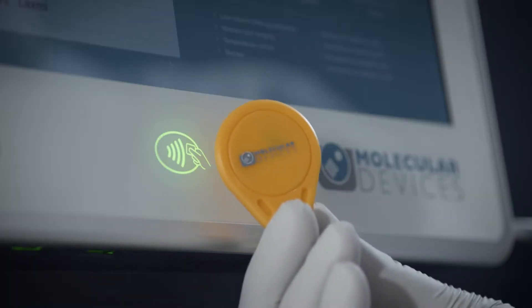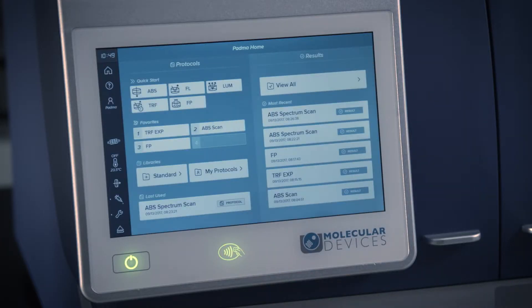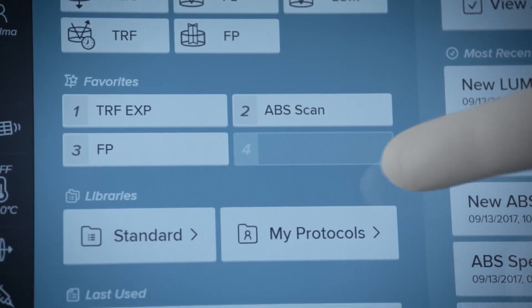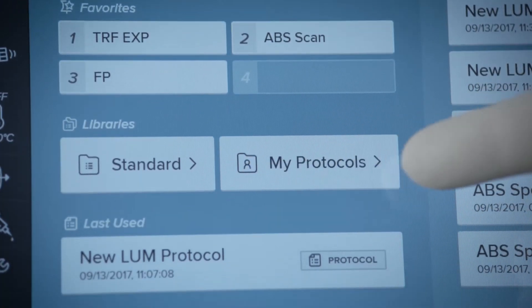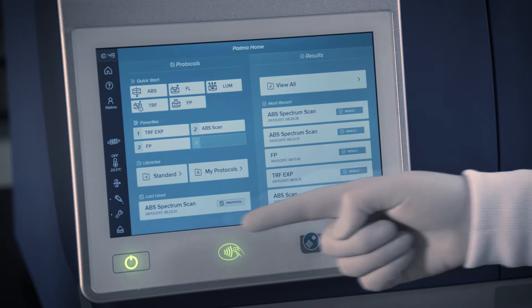After logging in, you're greeted with your personalized home page, which features easy access to quick start protocols, your favorite protocols, an extensive pre-configured protocol library, your results, and managing instrument operations.